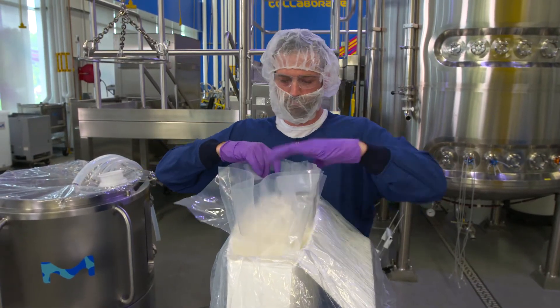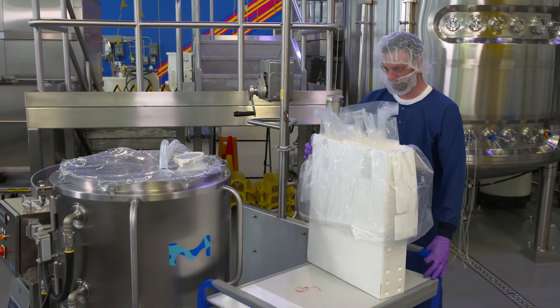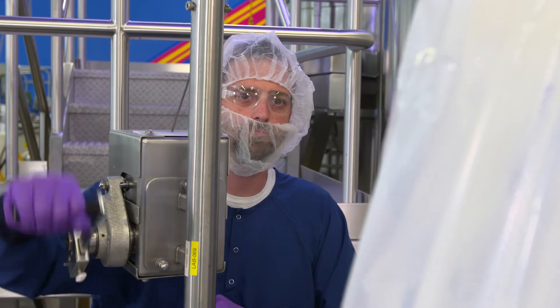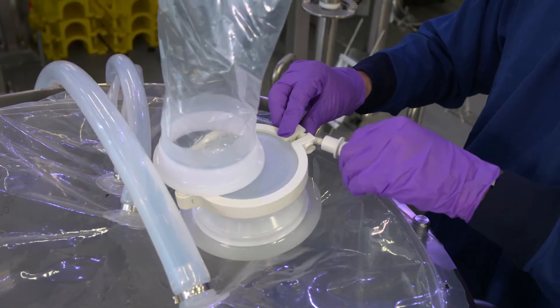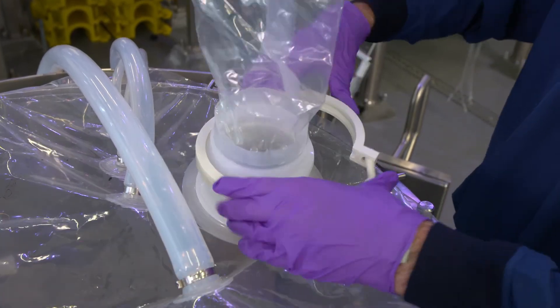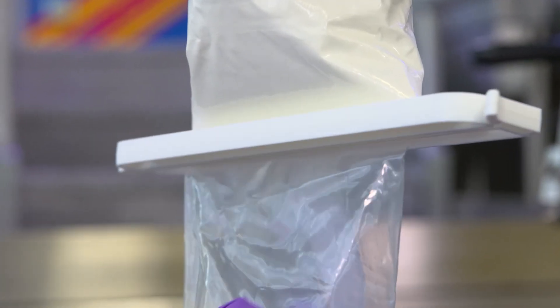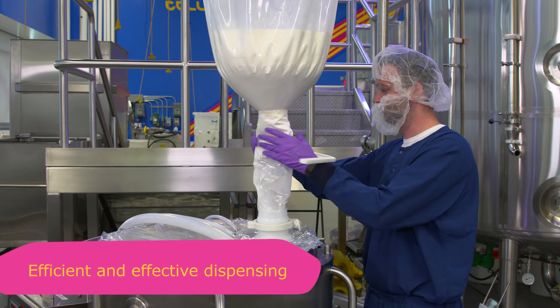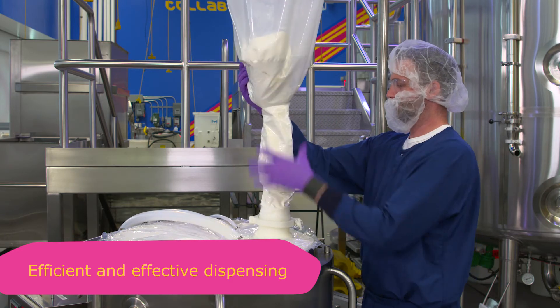When the bag arrives at your facility, all you have to do is open the outer container, use a lifting device to lift the bag out of the outer container, and place the bag into position. As you can see, the powder is still in place. Our bag is ergonomically designed with industry-compatible connections. The standard sanitary and stretch fit connection options can easily be used with standard or single-use operations. The robust built-in lifting handles for small volumes and lifting loops for scale-up make the bag ideal for any operation. Once you remove the wheel lock clamp or zip tie, the powder can flow directly into the hydration tank, minimizing product contamination risk while safeguarding your employees and facilities.